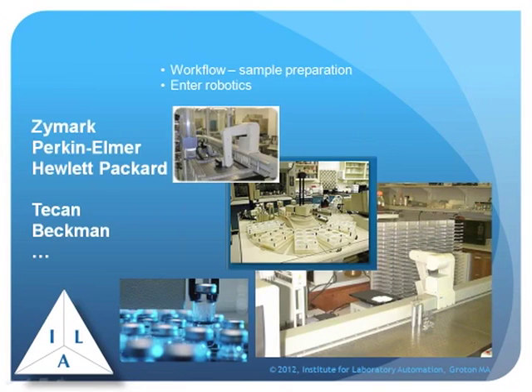And we'll start there, because historically, that's where robotics in laboratories began. When robotics began, we were looking at three vendors: Zymark, PerkinElmer, and Hewlett-Packard. And just for historical purposes, Zymark was purchased by Caliper a number of years ago, and Caliper was just recently purchased by PerkinElmer. So PerkinElmer, who got out of the robotics business for a while, is back in it.